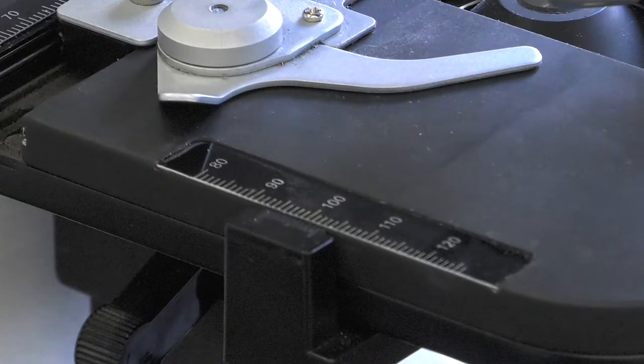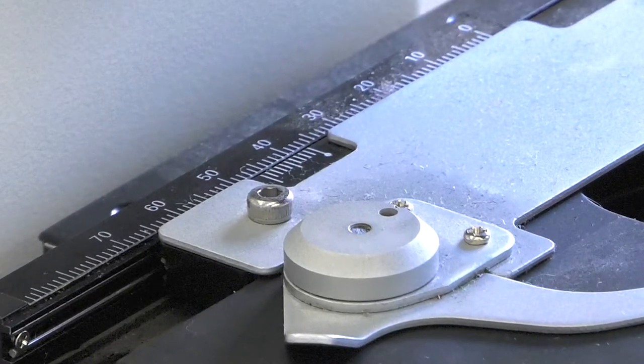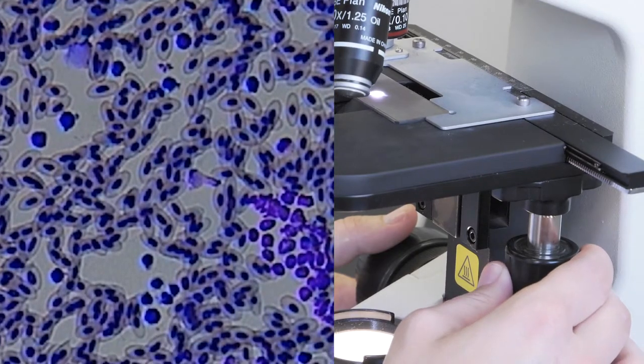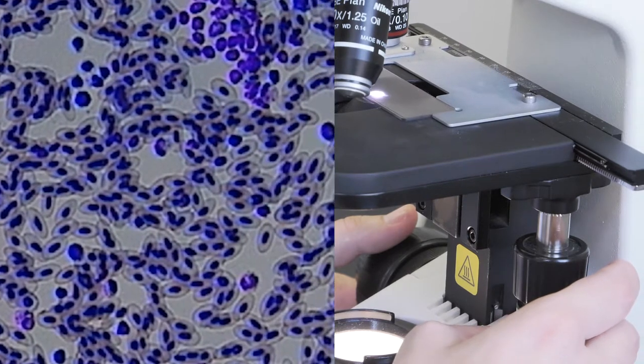The stage usually has a vernier. It is a kind of ruler to determine coordinates of interest in the sample, with a precision of about 100 microns. It makes it easy to locate the same view in later observations.